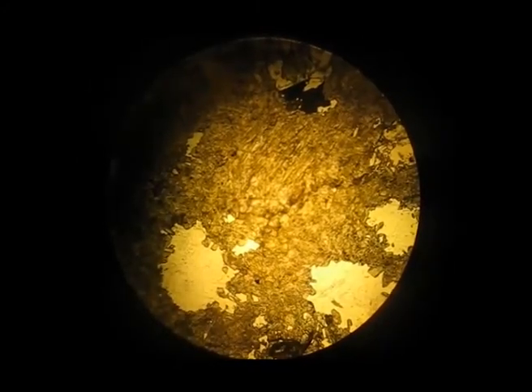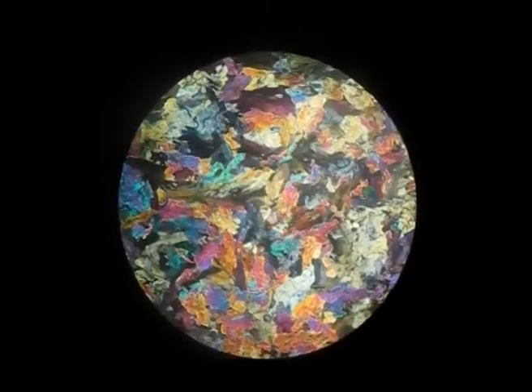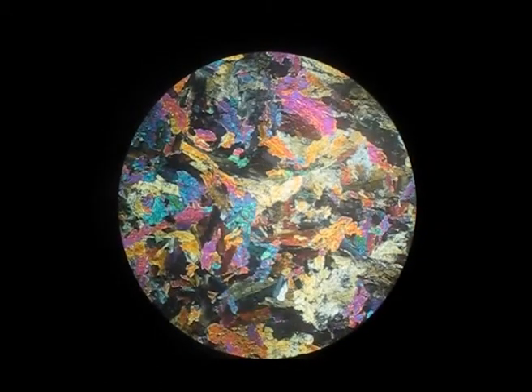In anisotropic minerals, the index of refraction differs with direction. A mineral fragment showing high relief in one direction and low relief in another is said to have variable relief, and such a mineral shows this on rapid rotation of the microscope stage under plane polarized light without using the analyzer. Variation in relief, with alternation of strongly marked and slightly marked borders, gives a twinkling effect, and hence this phenomenon is called twinkling. Calcite is a very good example of a mineral showing twinkling.